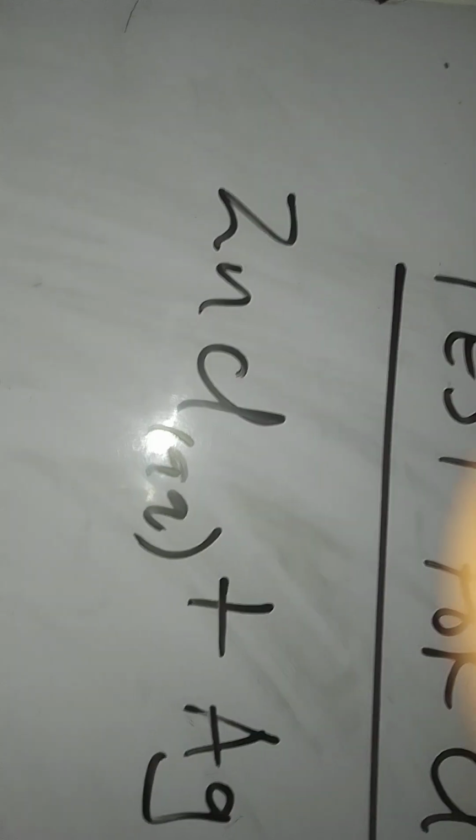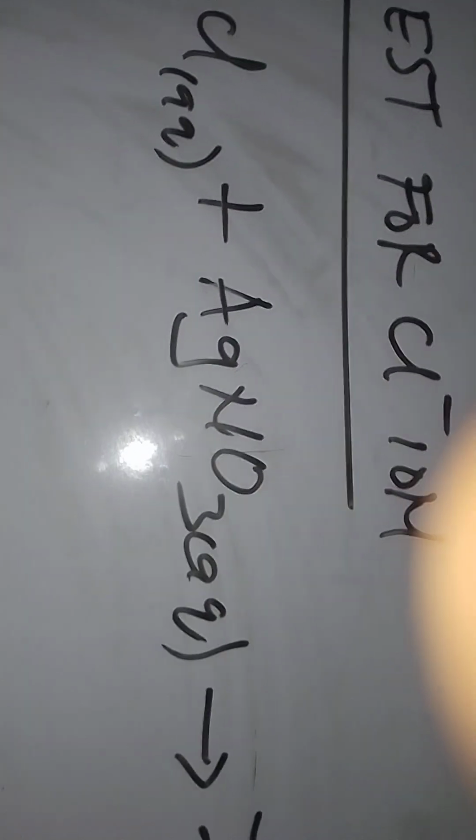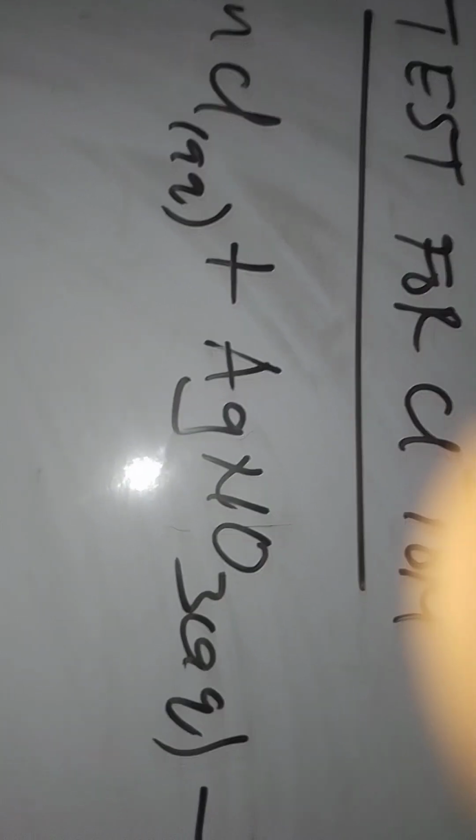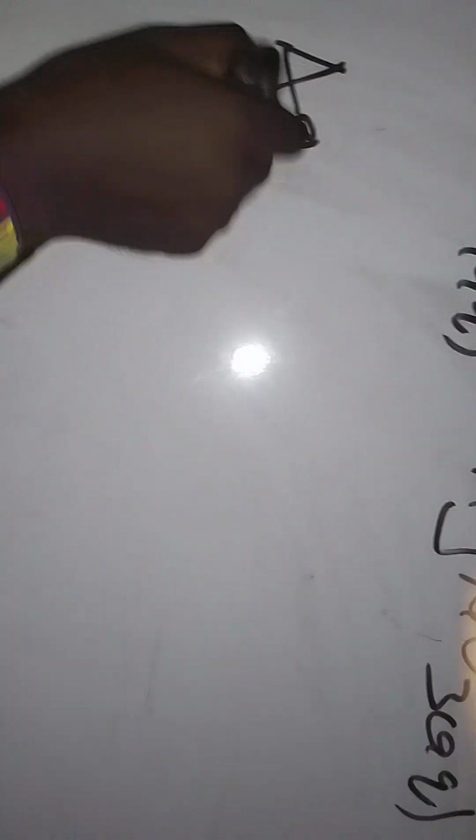Now when you add AgNO3, you are going to have a white precipitate of silver chloride, AgCl, white precipitate. Nothing like gelatinous this time around though, be careful. White precipitate plus what? Plus zinc nitrate. Zinc nitrate, so this is an aqueous solution. So that is that.